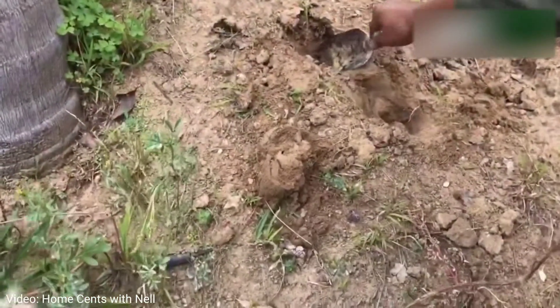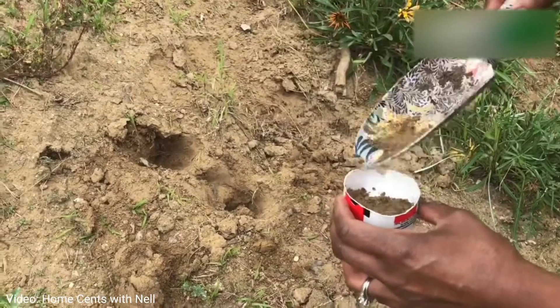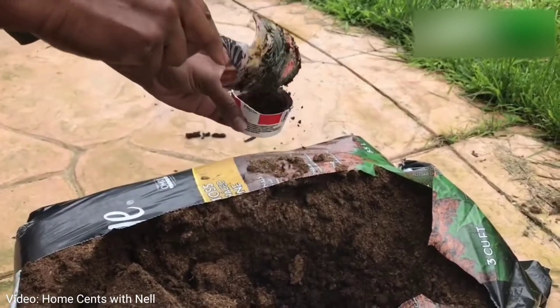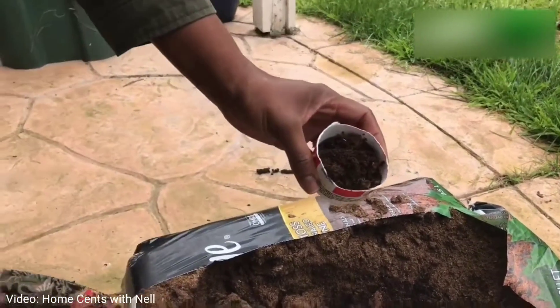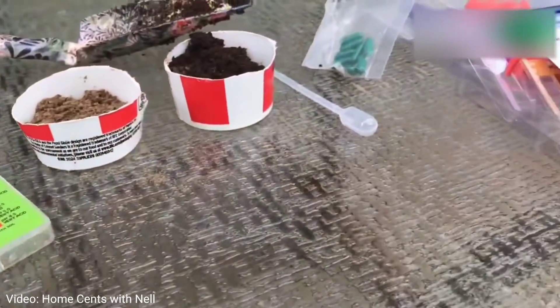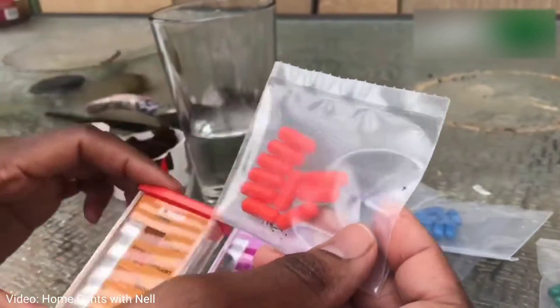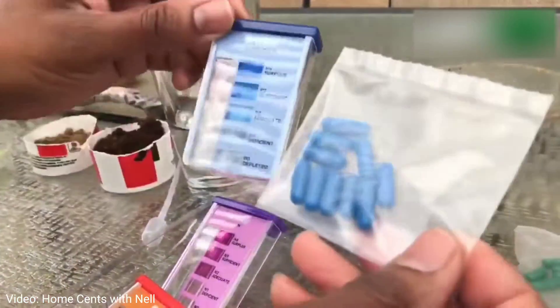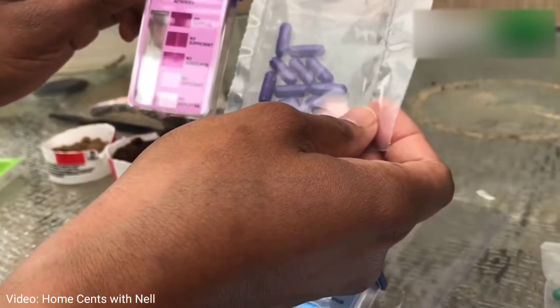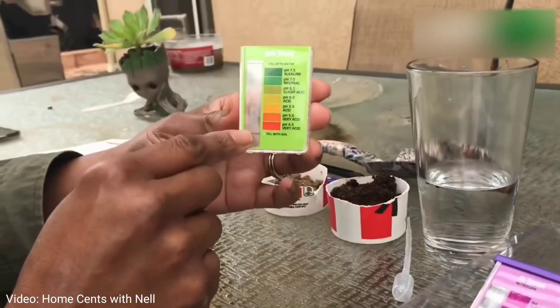The first step to analyzing your soil is to go ahead and collect a dirt sample, or a soil sample, about four inches below the surface — that's what's recommended if you're going to grow vegetables. I also collected a little bit of peat moss, which I'm going to show you how to use later. Here's the test kit: you have very precise and simple instructions, four different comparator cases, color-coded capsules, and a pipette. The orange is for potassium or K, also known as potash; the blue is for phosphorus; the purple is for nitrogen; and the green is for testing your pH.